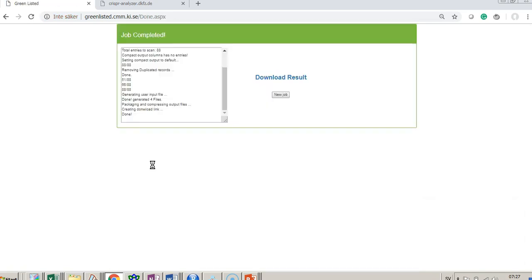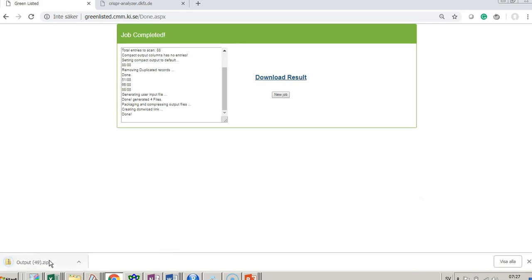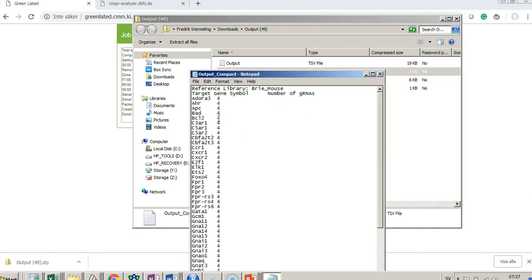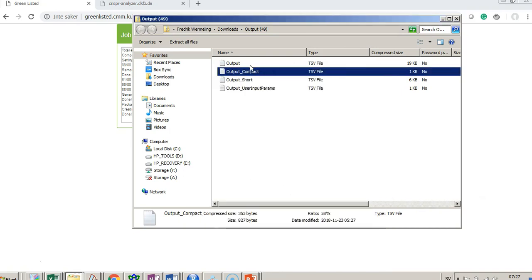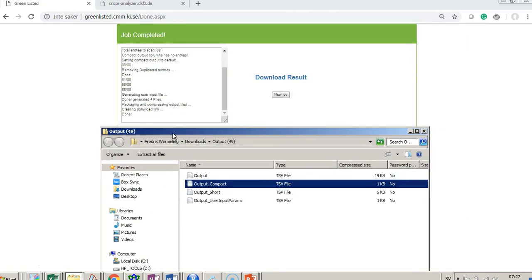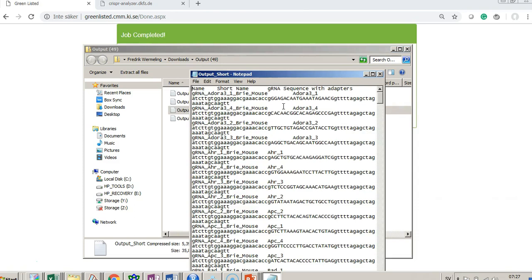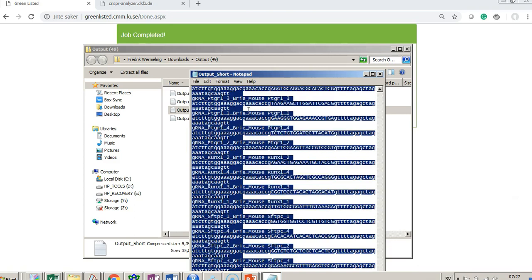We press run and you see it start counting up. We had 88 genes in this small screen. The download result comes up, and we can look at the compact list to see the genes and the number of guide RNAs found — four per gene, which is expected. All guides were found: 88 out of 88. Then we can go to the output shortlist.